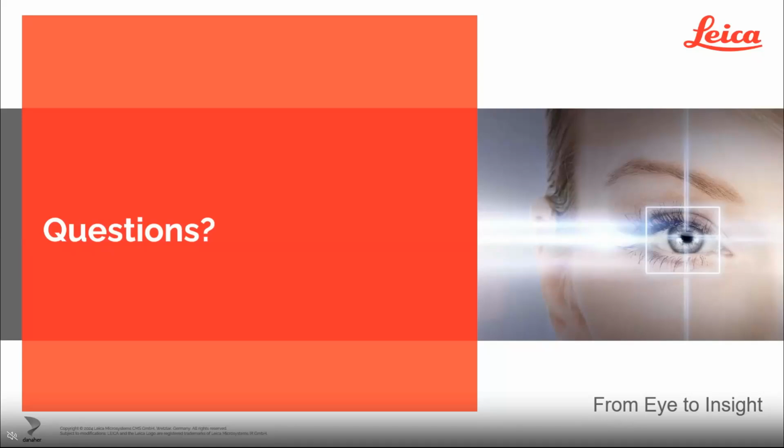All right, our next question asks, is this tool equipped with a micro CT scanner? Yep, I'll take that one as well. That's a great question. The UC Enuity itself, our ultramicrotome, is not equipped with its own micro CT scanner. You'll need to use an external third-party micro CT system to generate your data first. What we do on the UC Enuity is import data from a micro CT system and manipulate that data, as Jan showed, to trim to a certain depth with certain orientation.